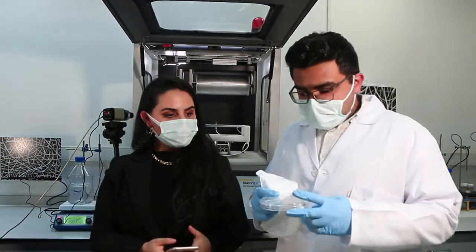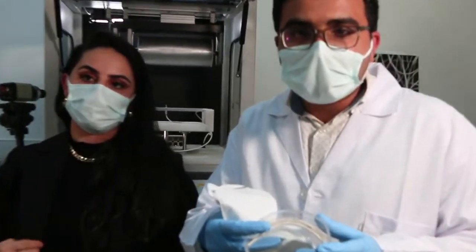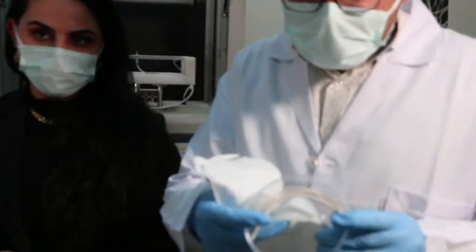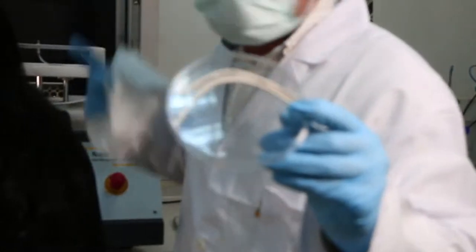All right. So this is the blood vessels we were talking about, the artificial blood vessels we made from the tubular structure. You can see that these are tubular structured nanofibers that we made from the mill shaft, as I showed you at the start of the experimental trial.